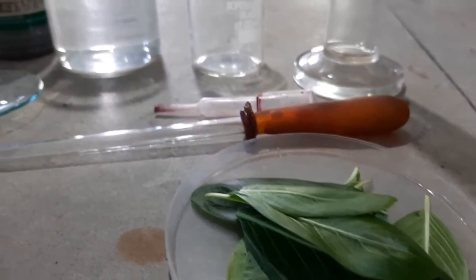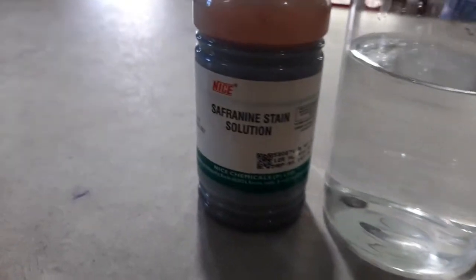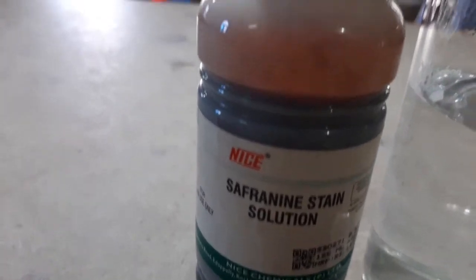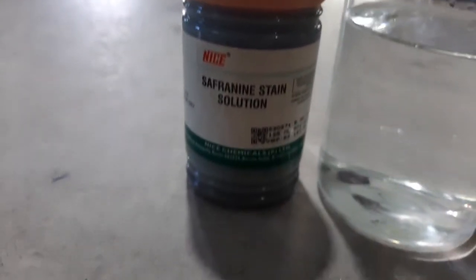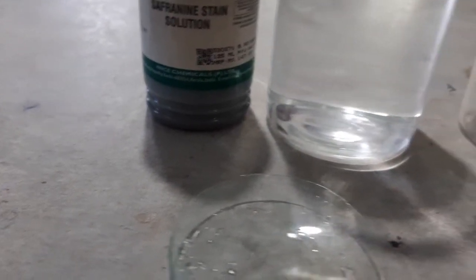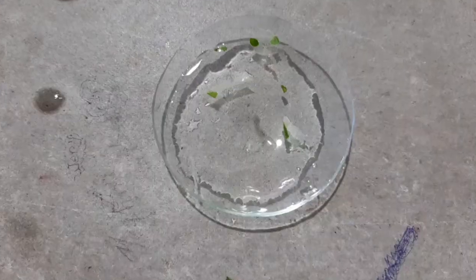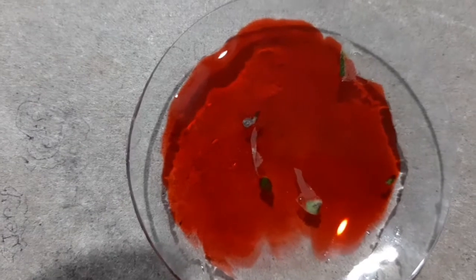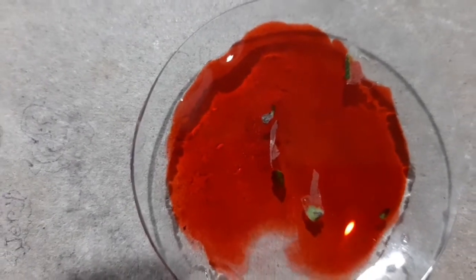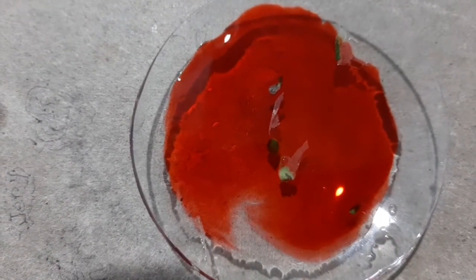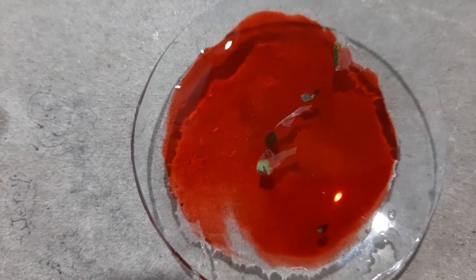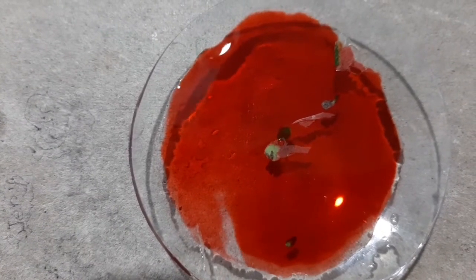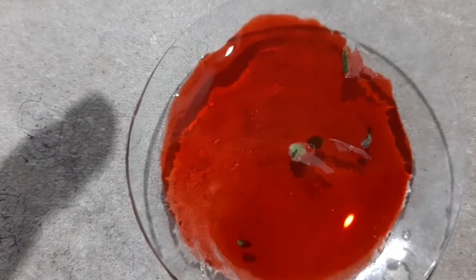After peeling out the epidermis, you keep this epidermis in a watch glass with distilled water so that this epidermis does not dry up. And then you can put a drop of the safranine stain and then you keep it for two to three minutes undisturbed so that the piece gets stained.